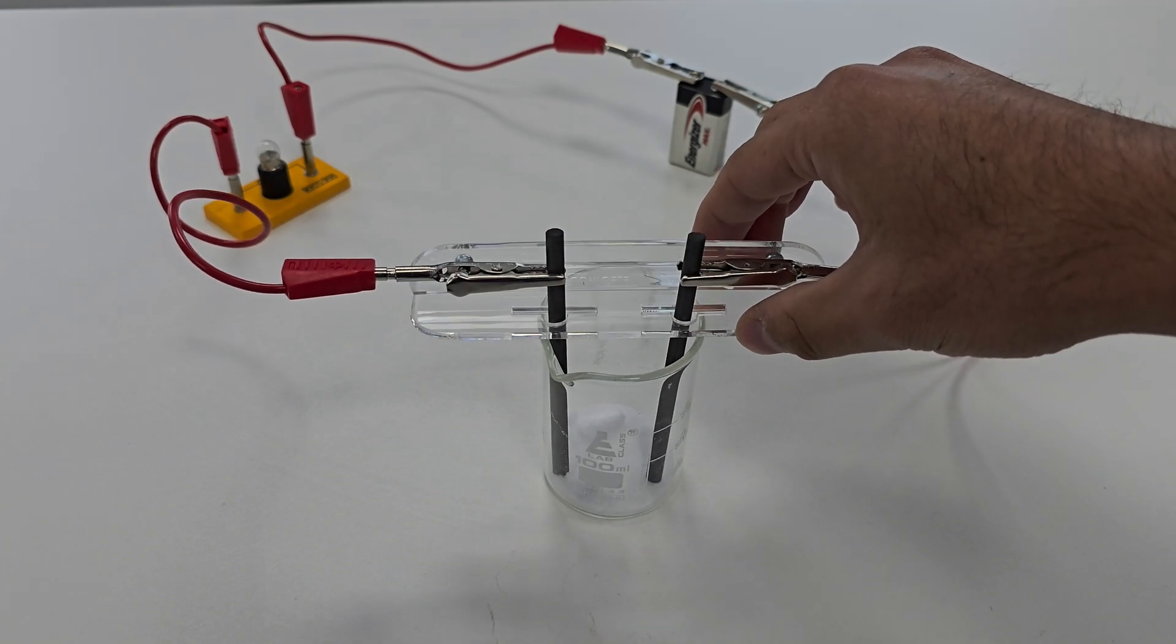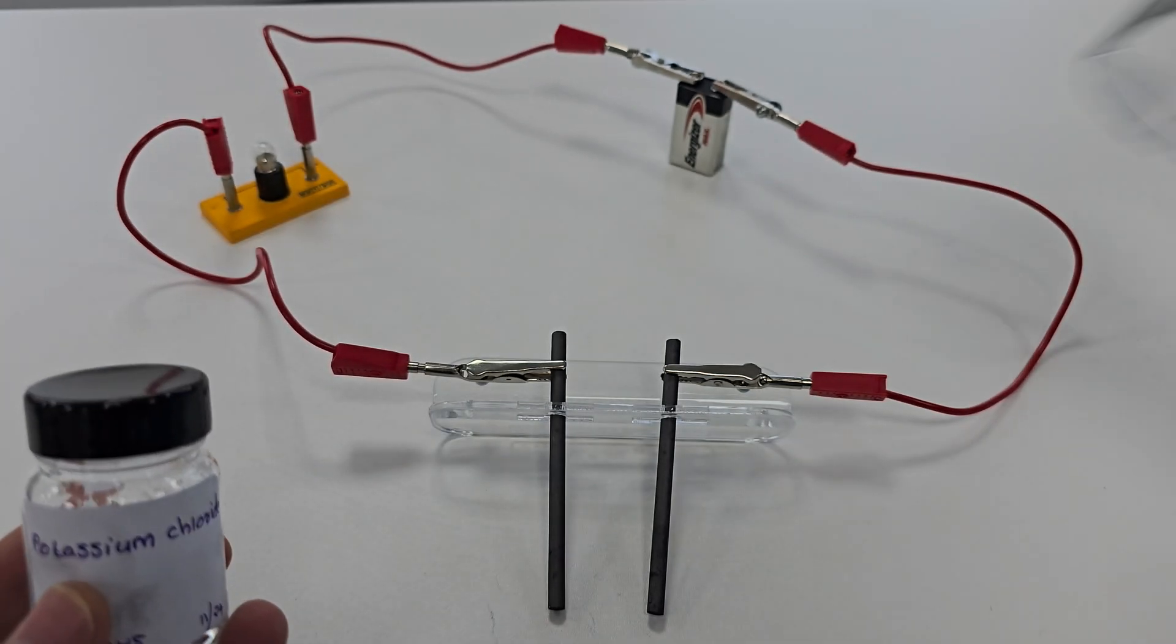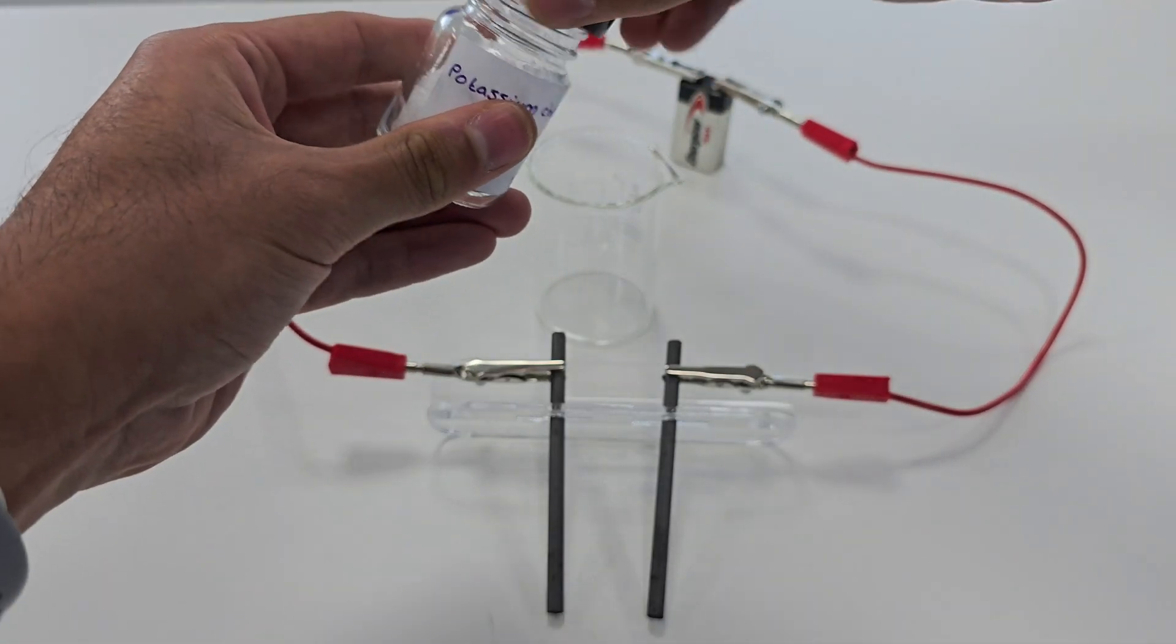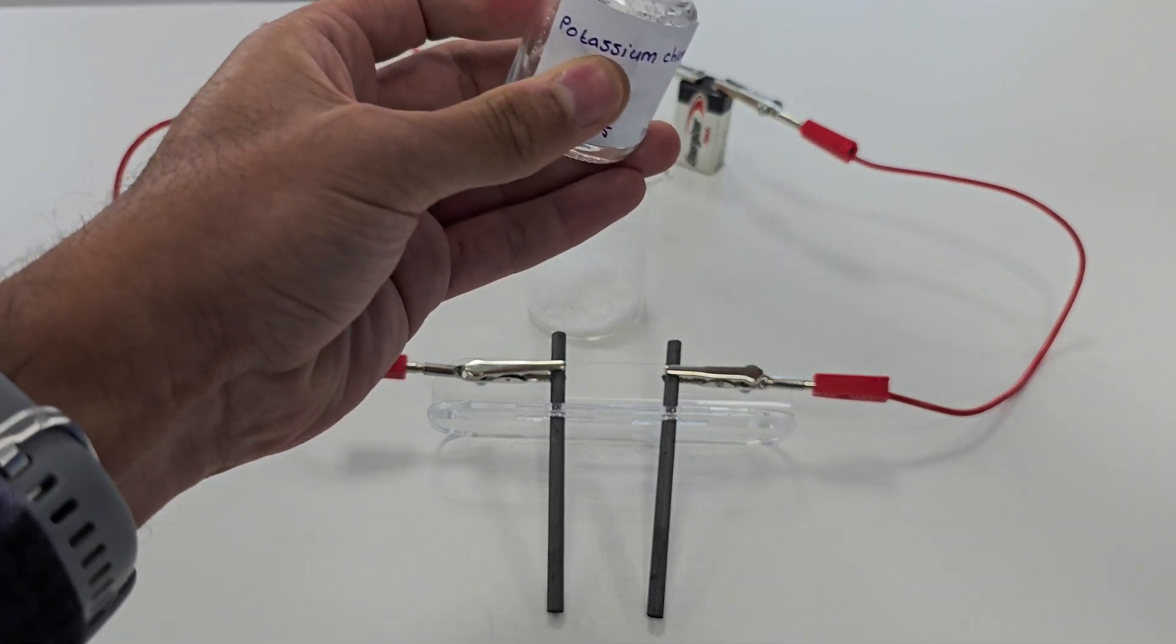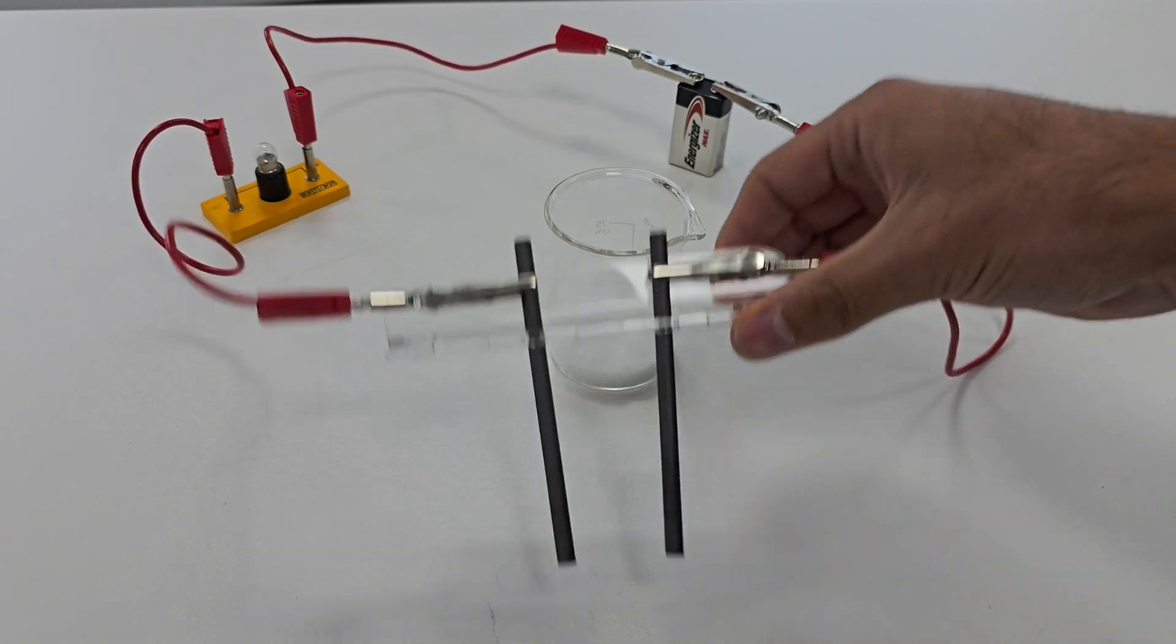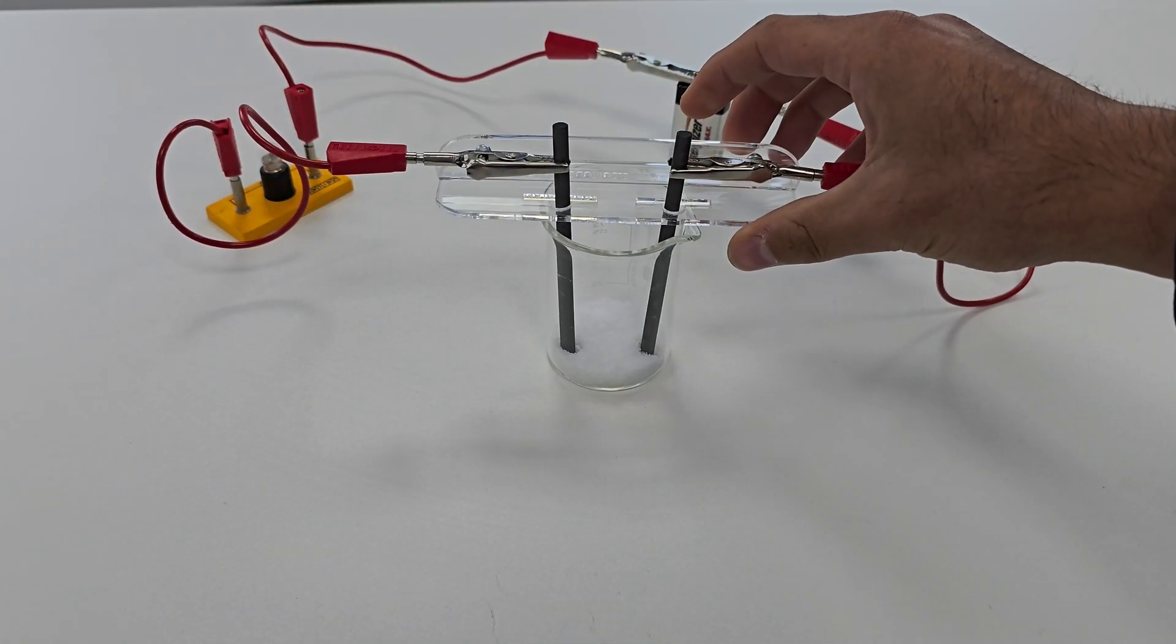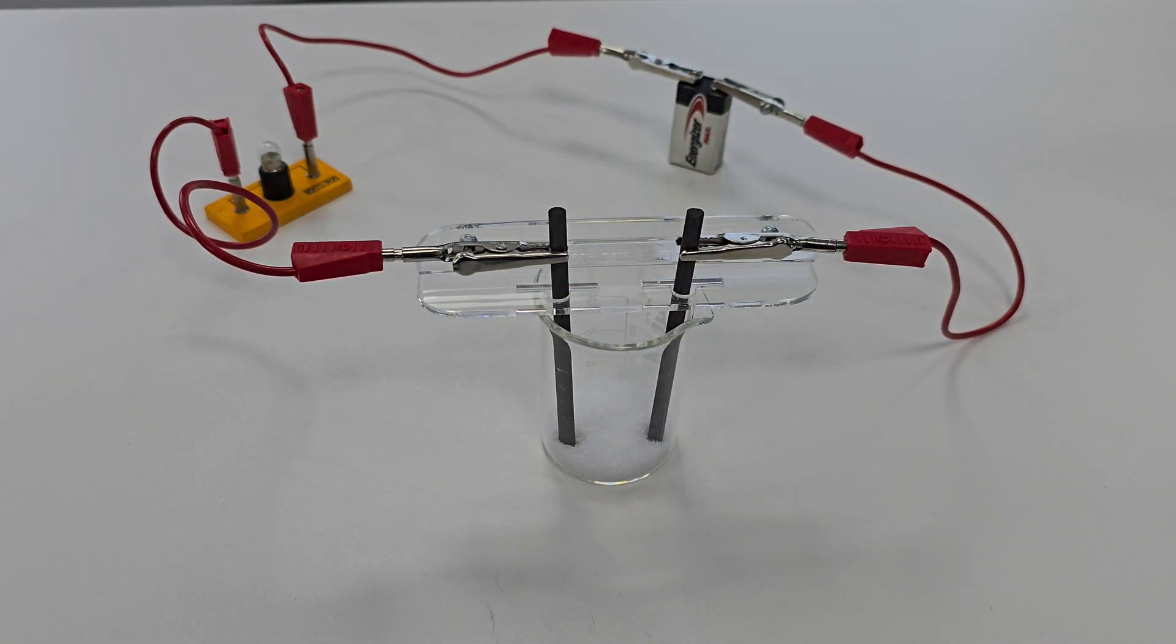Let's repeat this experiment with potassium chloride, another ionic compound. Like sodium chloride, its ions are locked in a rigid lattice in the solid state. Again the bulb does not light up, showing that solid potassium chloride is also a non-conductor.